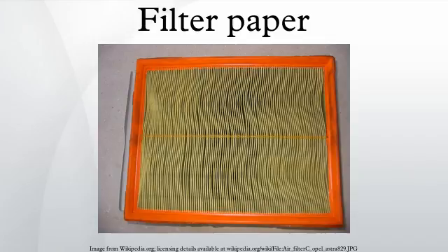Extraction thimbles. Extraction thimbles are rod-shaped filter paper often used in Soxhlet extractors or automated extractors. It is ideal for very sensitive detection. The performance depends on the thickness of the inner diameter. Also, it is usually used in areas of food control and environmental monitoring.